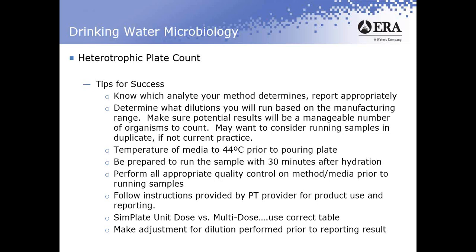Simplate unit dose versus multi-dose. This doesn't happen a lot, but we do see it periodically. Those two products have two different tables that you use to determine your final most probable number. You need to make sure that you're using the appropriate table with the appropriate format of the product.